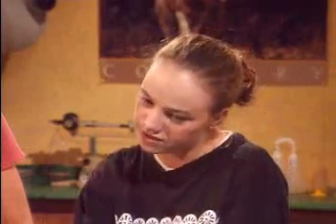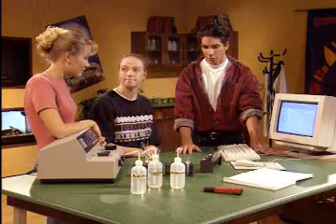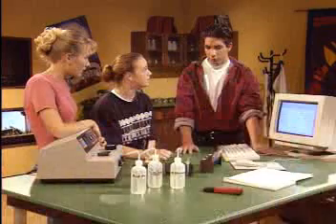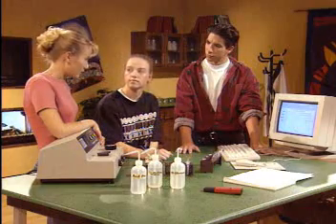Then what was your hypothesis? Well, what do you think? I had 3 different environmental conditions. One was cold, a greater supply of food, and an acidic condition. Well, if the yeast had a greater supply of food, it means it'd have a greater supply of energy. So there should be more in that test tube than in the control. And cold would slow down their metabolism, so there'd be less yeast produced in the fridge. And then there was that acidic environment with a pH of 3. Well, things generally don't grow well in acid, so I'd guess there wouldn't be much growth there.